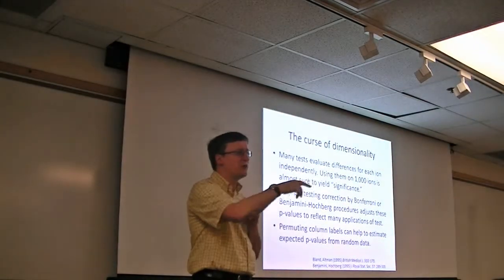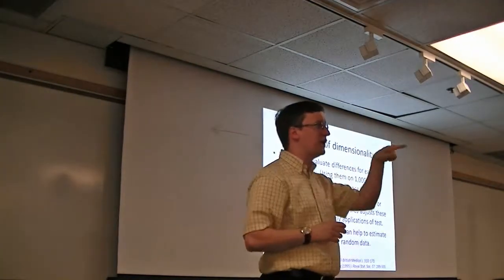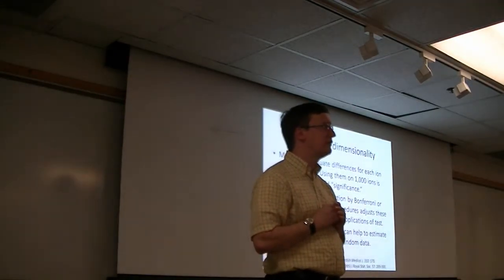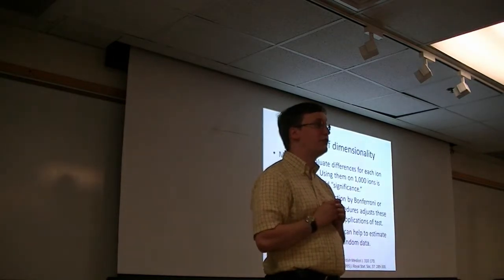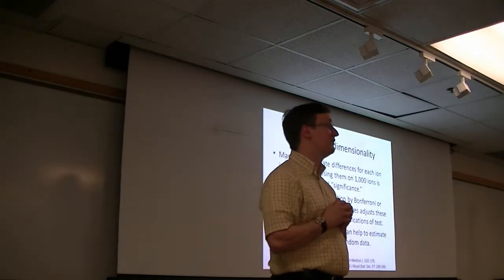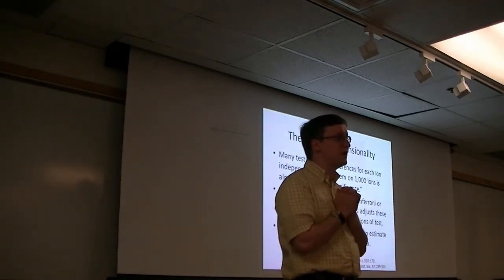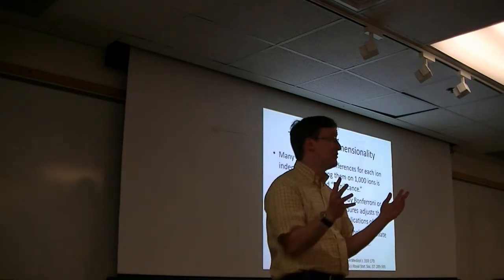How many p-values did I compute? 20, okay. So I computed 20 p-values. What number of those would I expect by random chance alone to have a p-value below 0.05? If they're uniformly distributed over the range 0 to 1, 1. By random chance alone, no difference at all between the two cohorts, I expect one of those 20 metabolites to be significant. So that's a problem.